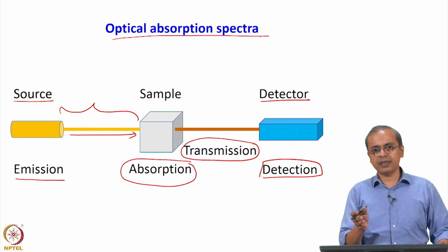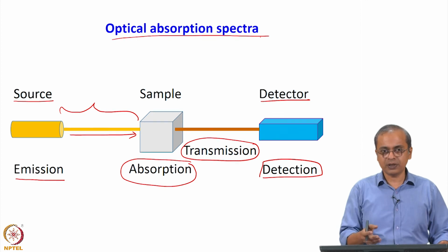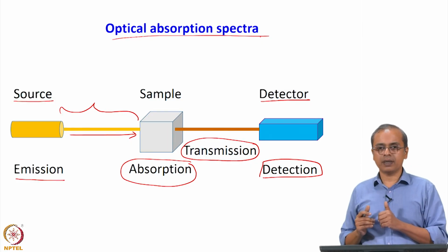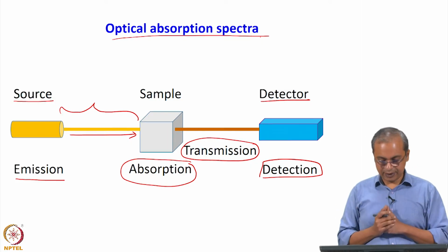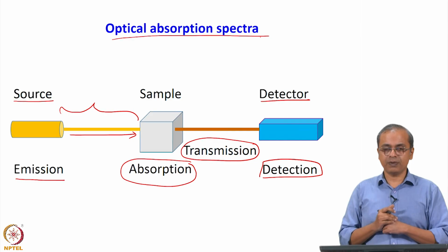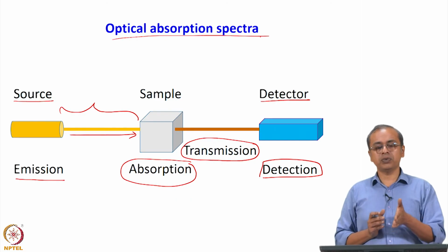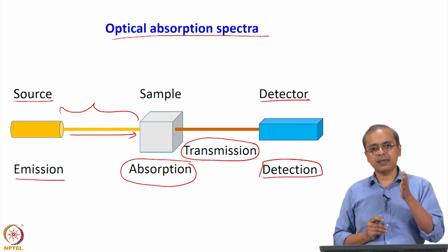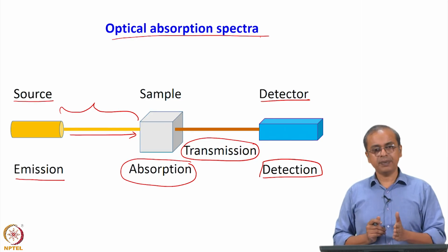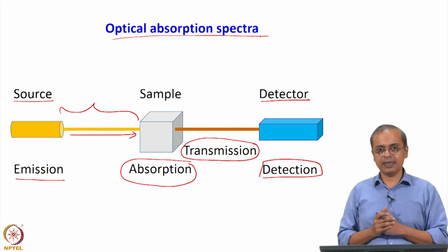And by carrying out the optical absorption spectrum studies, for a fair bit of frequencies you will not see some absorption, and then past some threshold you start seeing some absorption. From this data we are able to calculate and extract the band gap of that sample. So this is a very important technique for studying optical properties of materials in general and certainly of nanomaterials. And here again the template assisted synthesis is very useful because you are able to get those particles in a clear polymer sample which you can keep in this system, and therefore the polymer itself will not color the data in a dramatic manner.